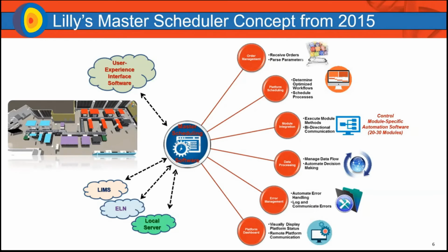Some of the functionality needed here: this master scheduler had to be able to interface with LIMS, ELN, and local databases. It also needed an interaction point or portal to the outside world where people could request work to be done. That's what we call the user experience.